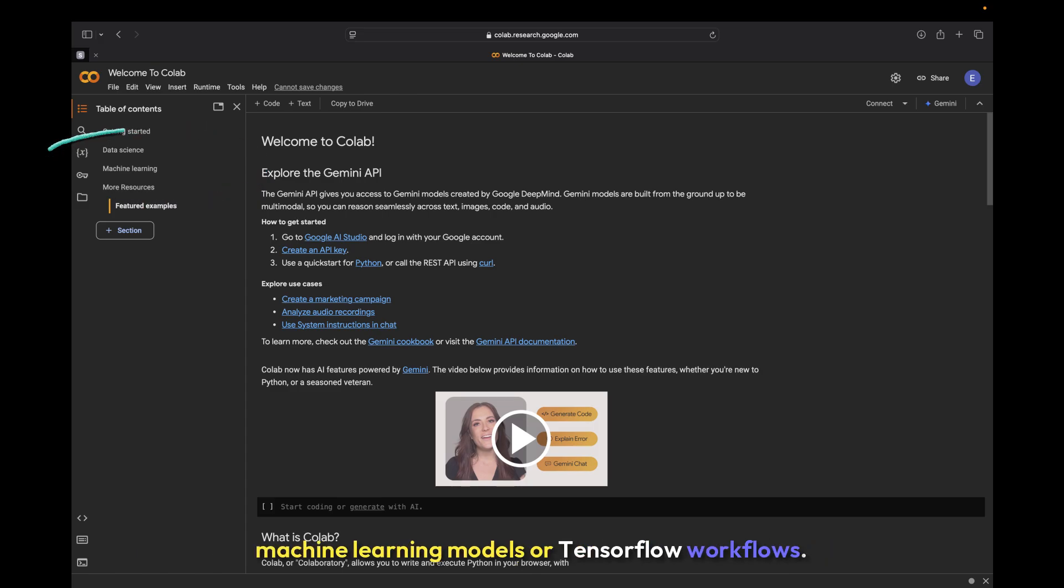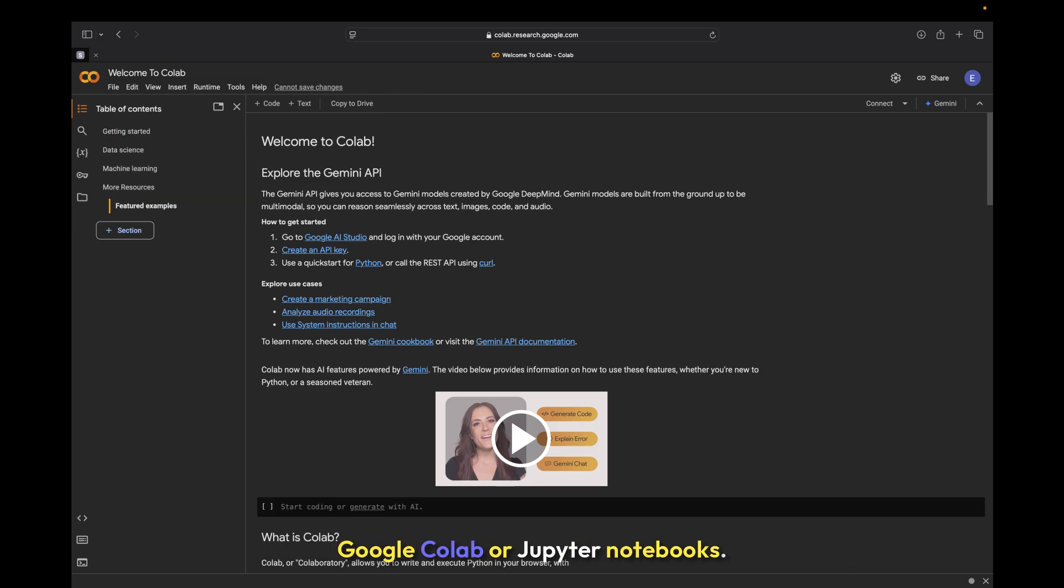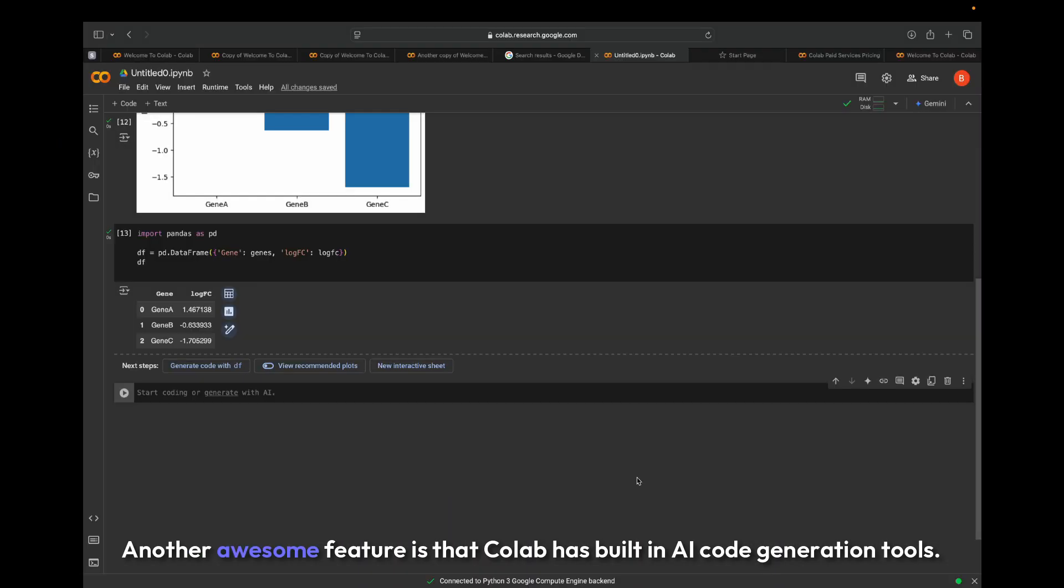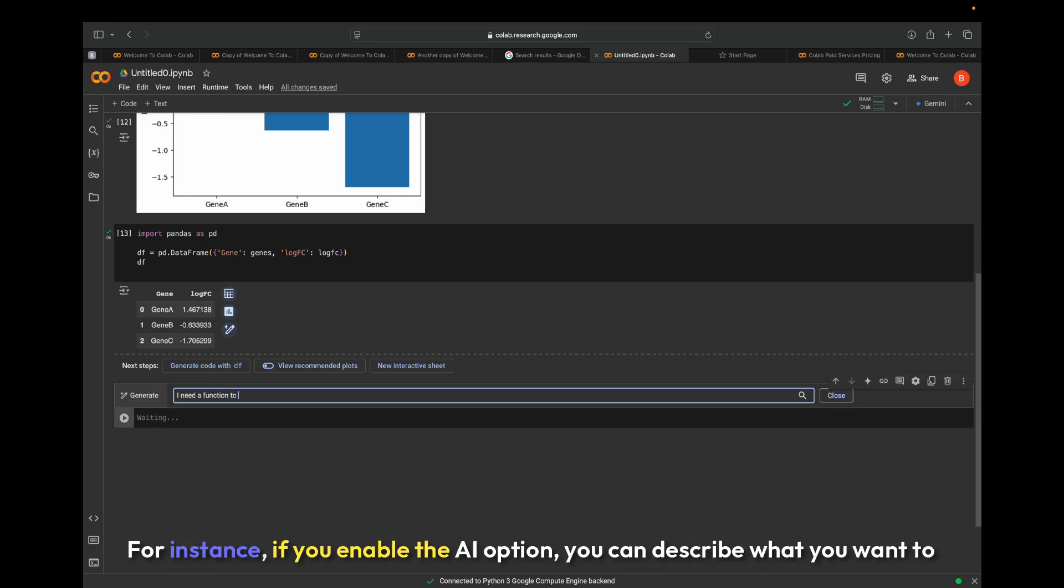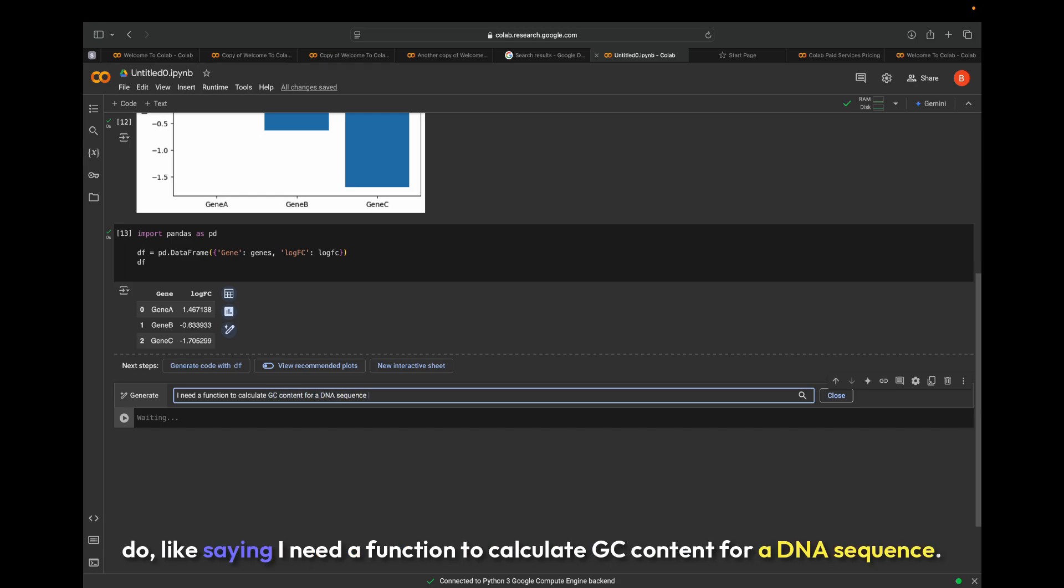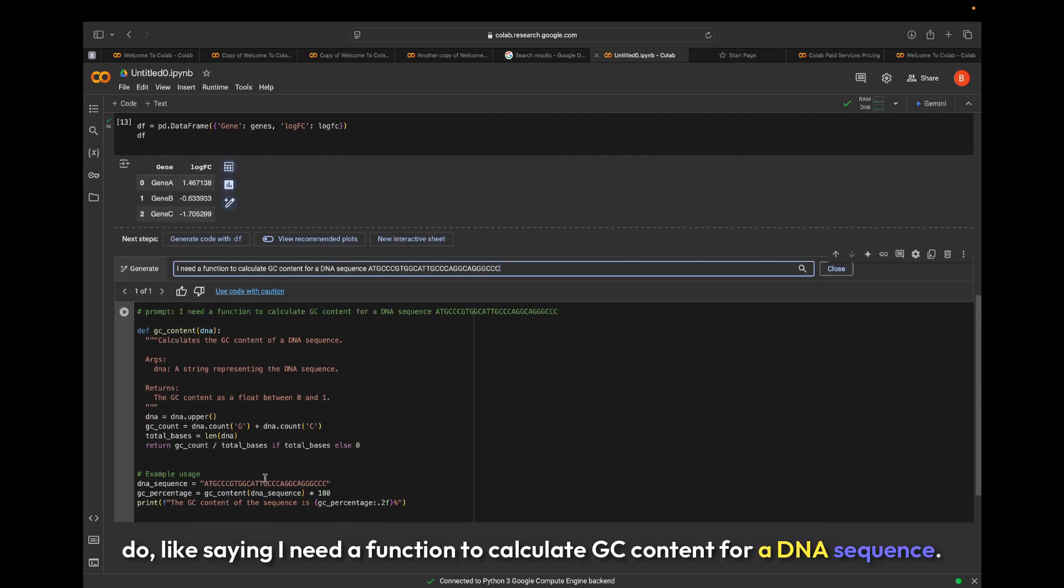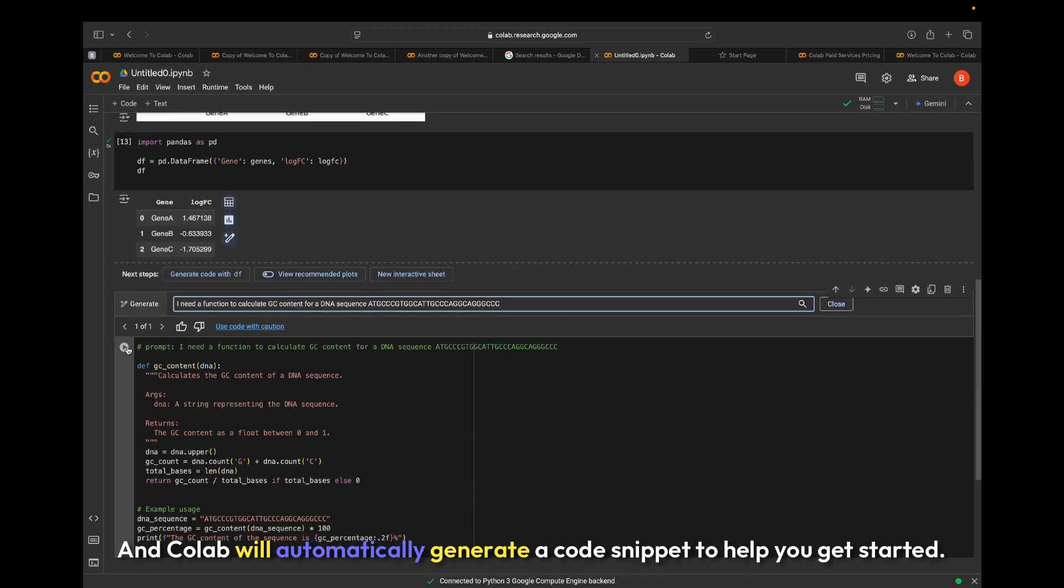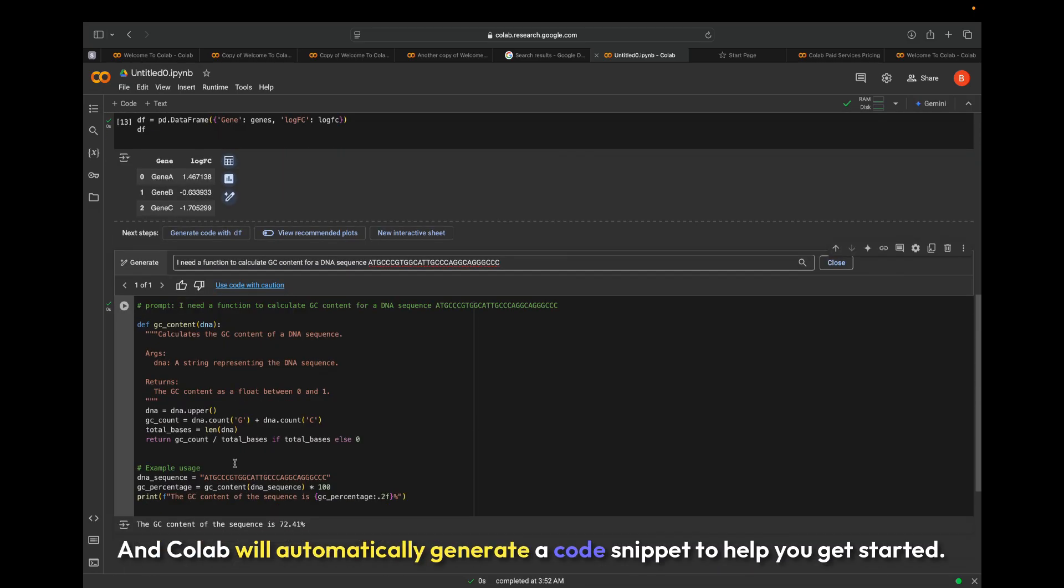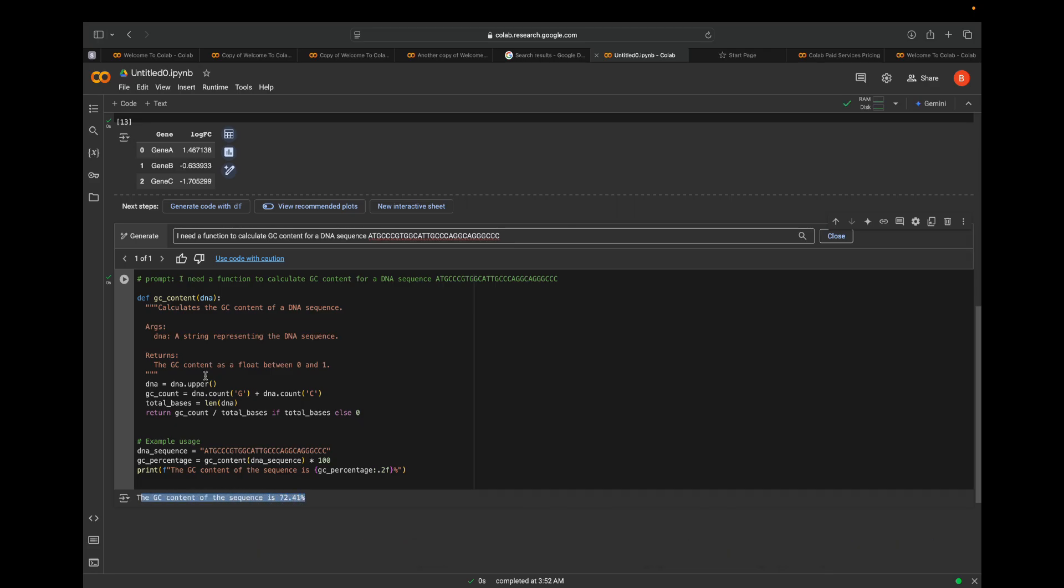In future videos, we'll be performing most of our bioinformatics analyses using Google Colab or Jupyter notebooks. Another awesome feature is that Colab has built-in AI code generation tools. For instance, if you enable the AI option, you can describe what you want to do, like saying I need a function to calculate GC content for a DNA sequence, and Colab will automatically generate a code snippet to help you get started.